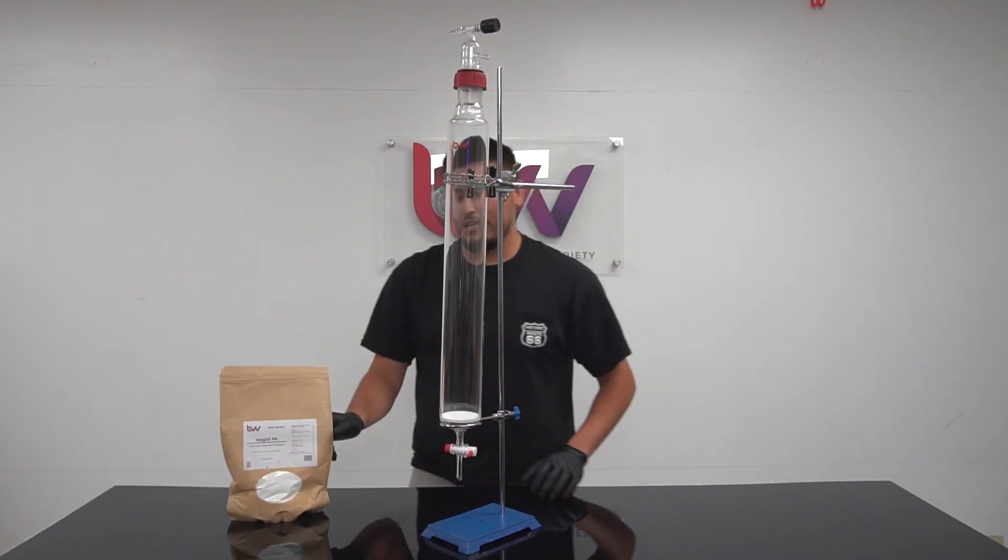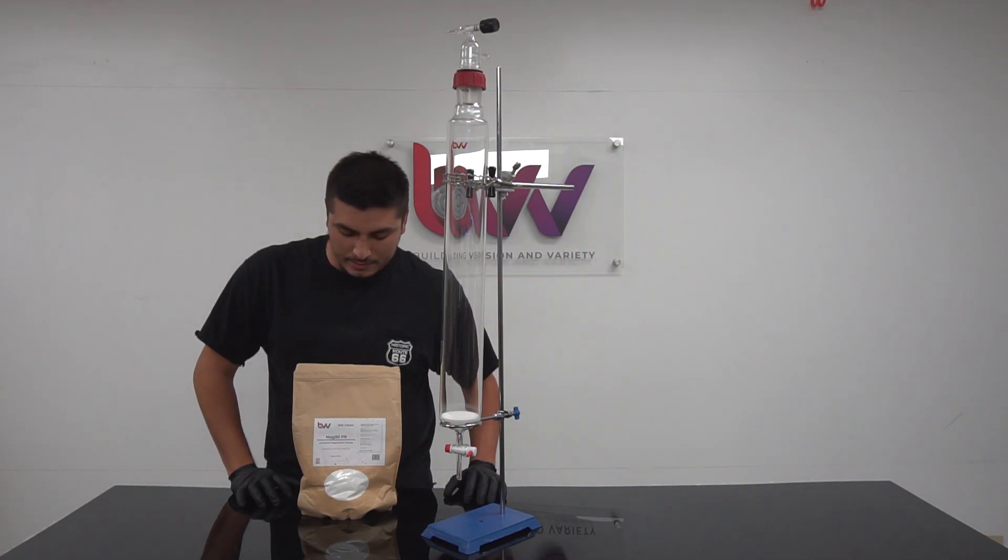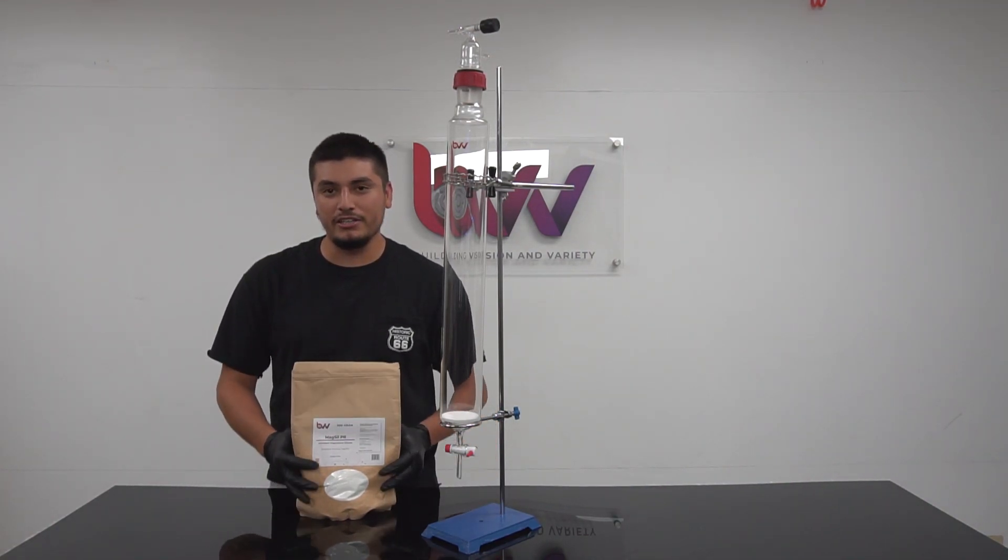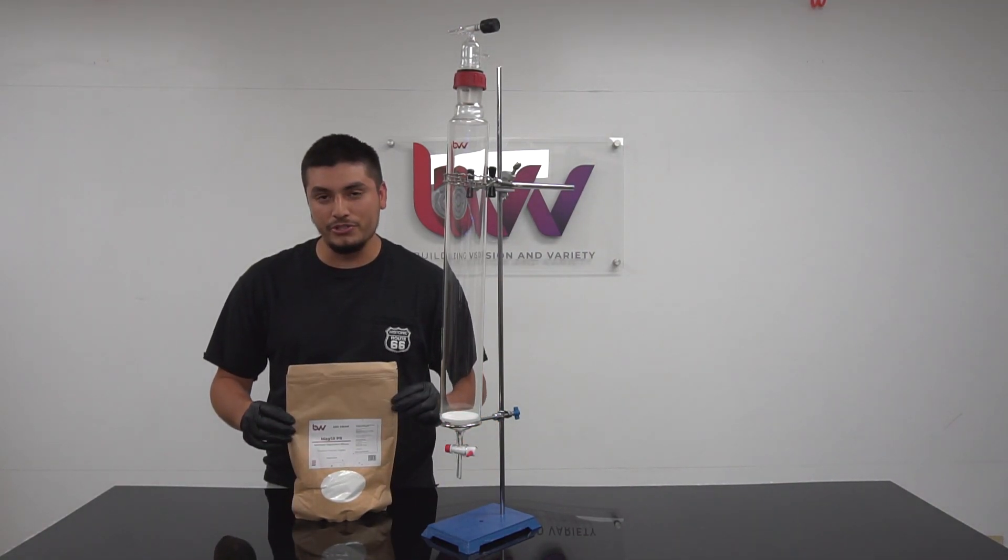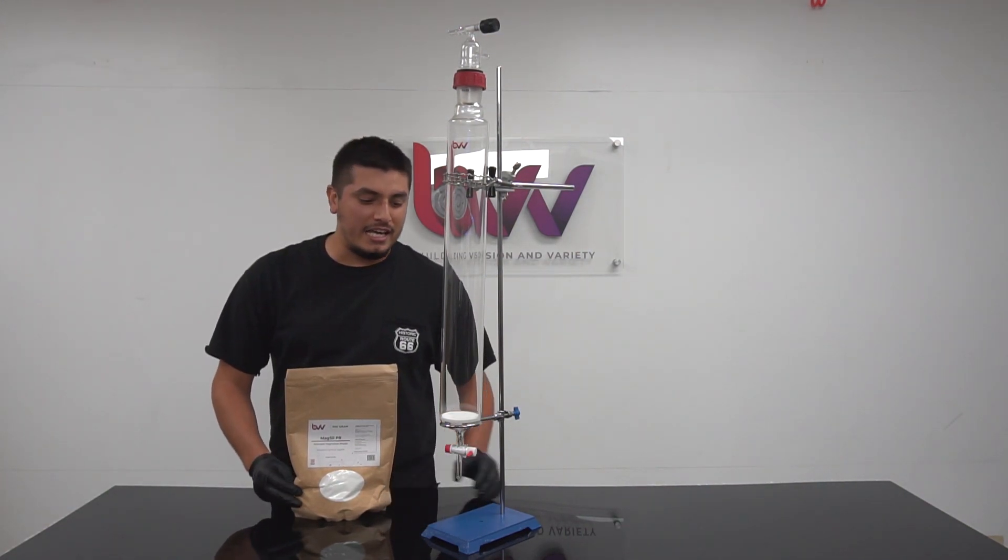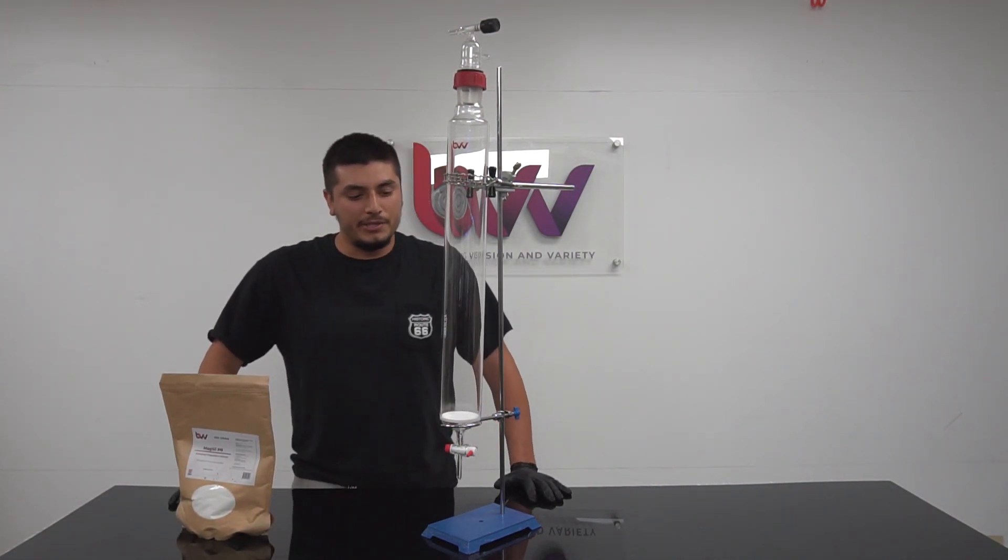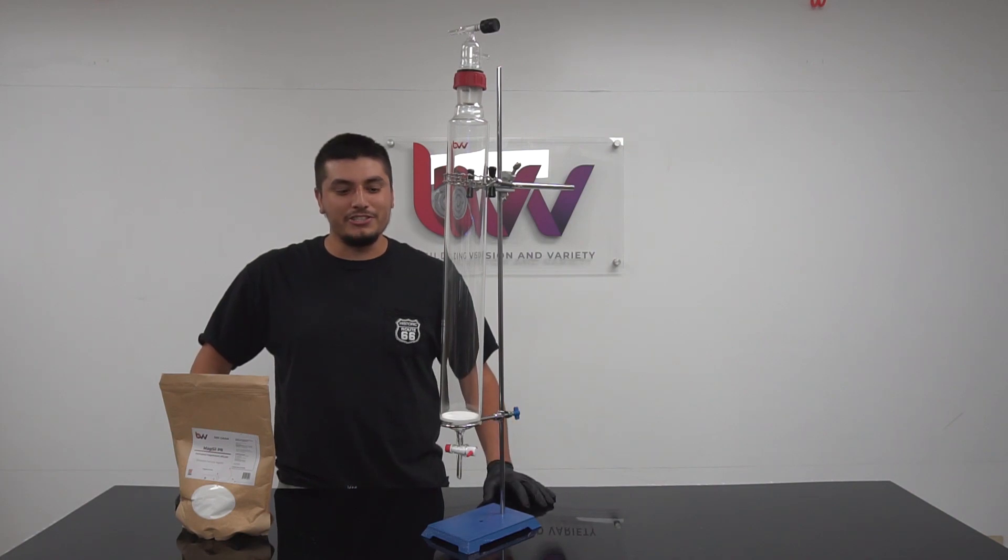One of the other products that our kit will come with or will be sold with is MagSyl PR. This is a product known from carbon chemistry, but we will also have our own product known as fluorosyl. That product can be used to wet pack the column and get it ready for any applications such as pesticide remediation.